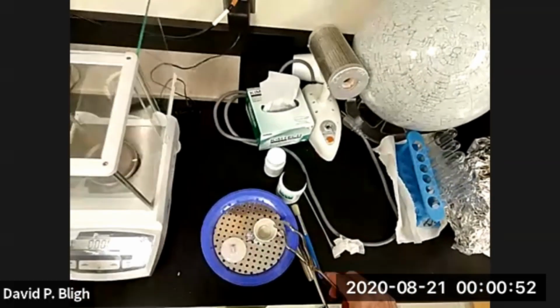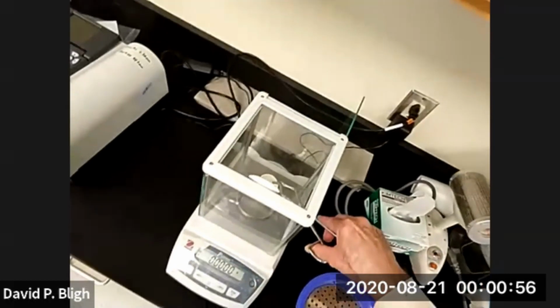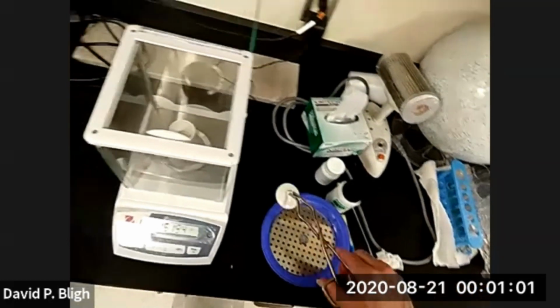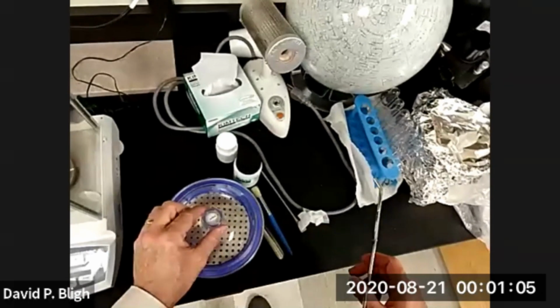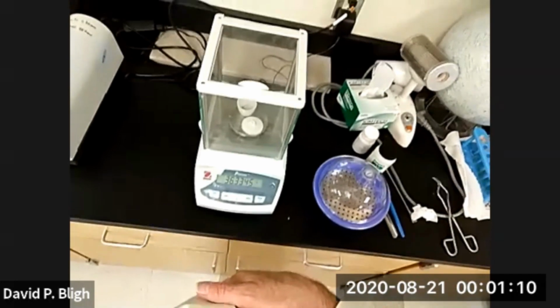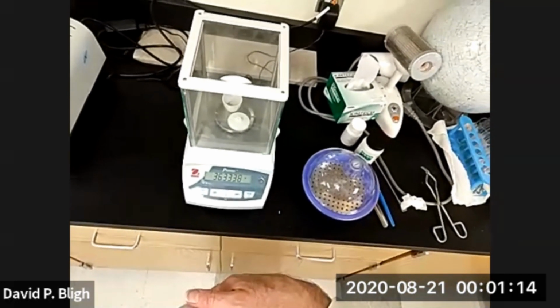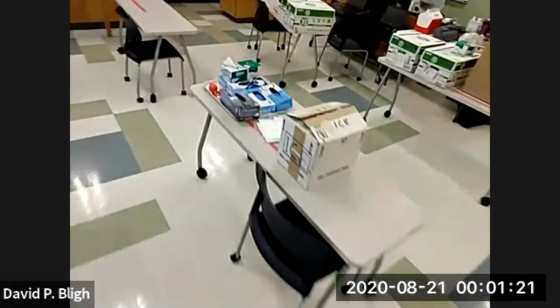Now we're going to get the mass of the crucible with the heated product inside. Okay. Hopefully it'll settle down. If not, we'll just have to guess. 36.3339.